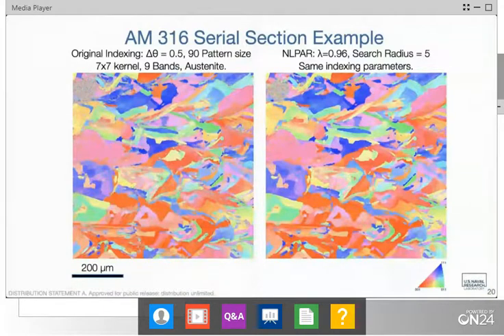If I am suggesting to somebody today what they would use, I would use Python with a combination of NumPy and SciPy and those types of things. It's come a long ways. In fact, I'm translating a lot of my codes over, but all of this reconstruction data is still done within IDL. It's really a replication of a lot of the EBSD routines. These IPF maps are made using that software, using the standard triangle for coloring, those types of things. They're just re-implemented inside of IDL.